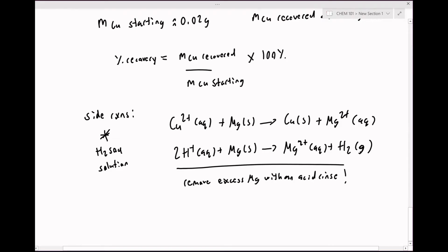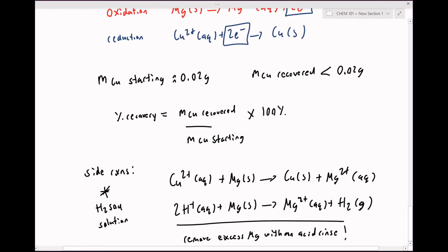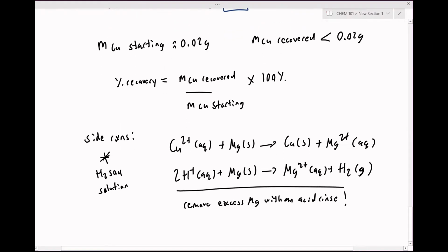Okay, so in effect, you're really wanting to focus on observations and recording your initial and final mass. The initial mass is the mass of copper that you start with through this redox cycle and set of chemical reactions, and the mass of copper recovered is the mass that we end with after all of the drying steps and re-isolation of our solid brick red copper. So at the end of this run through, we're now ready to begin the actual experiment recording. You're going to want to make sure you're recording your data to the proper number of significant figures permitted by your instruments.